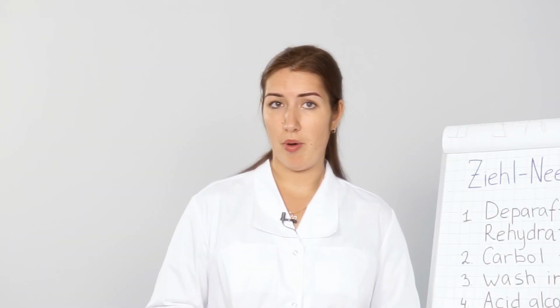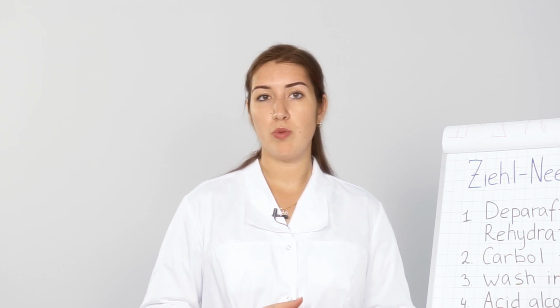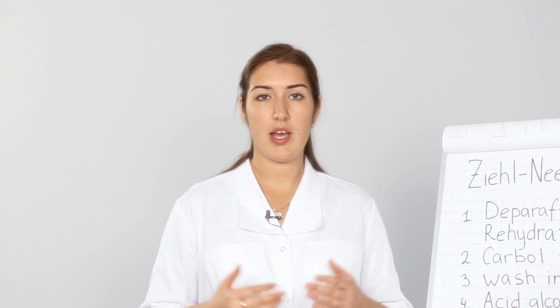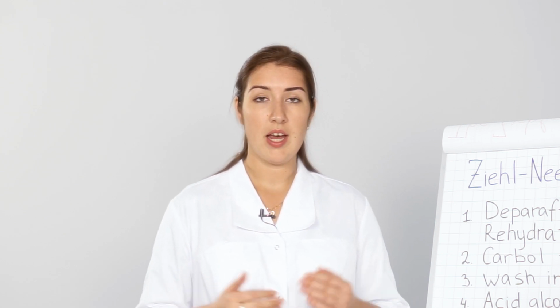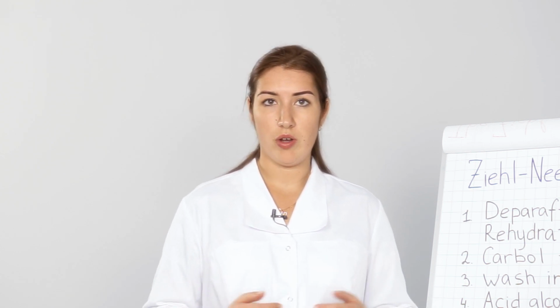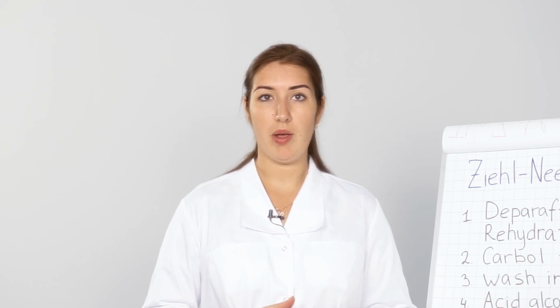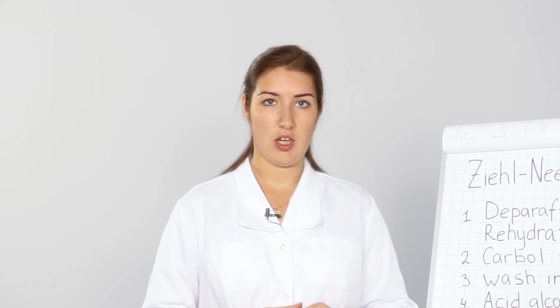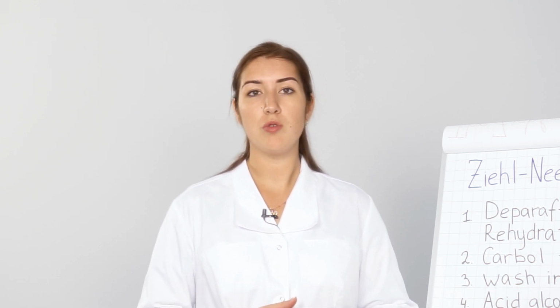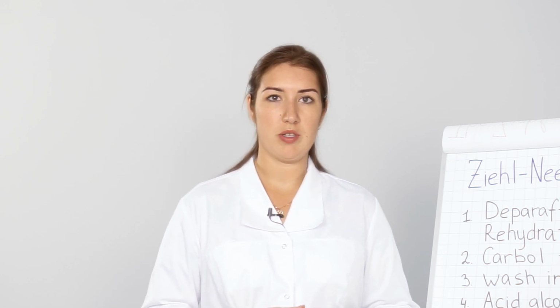What is important to remember when you apply a Ziehl-Neelsen stain? First of all, care should be taken to avoid over-counterstaining, as the scant organisms can be easily obscured. Secondly, decalcification with strong acid can destroy acid fastness of bacteria. Thus, formic acid is recommended to be used for decalcification. And besides, counterstaining agent can be substituted if color blindness causes recognition problems.